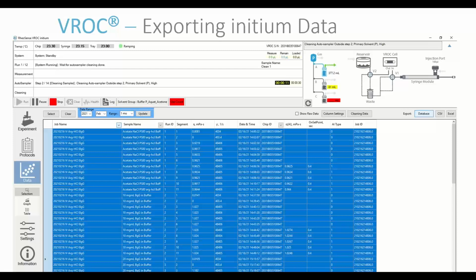As you highlight everything, it saves to the temporary memory of the software. So what you want to do, first things first, is clear everything. This just clears the memory that the software reads, and then you start clicking. Once you've highlighted all the data that you want to export, you then hit the select button here. It'll think and take some time, but then it'll prompt you.